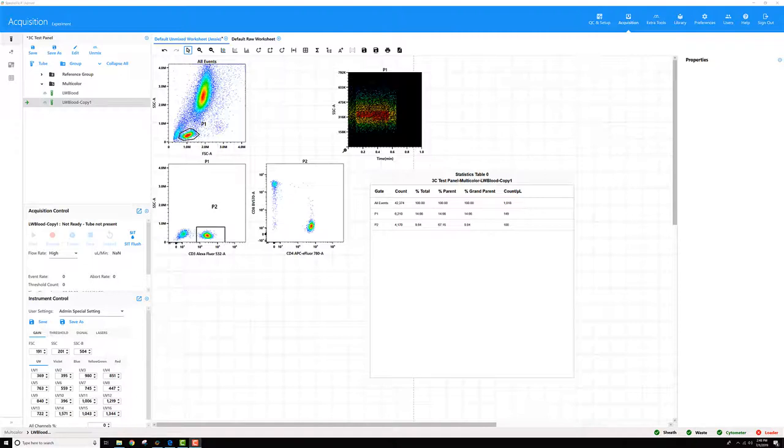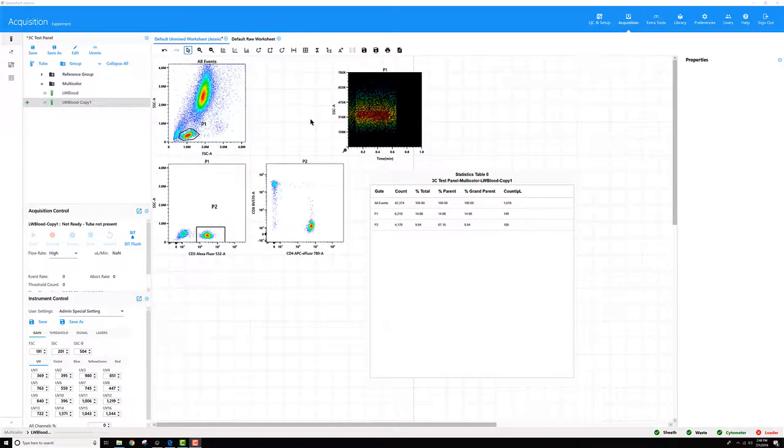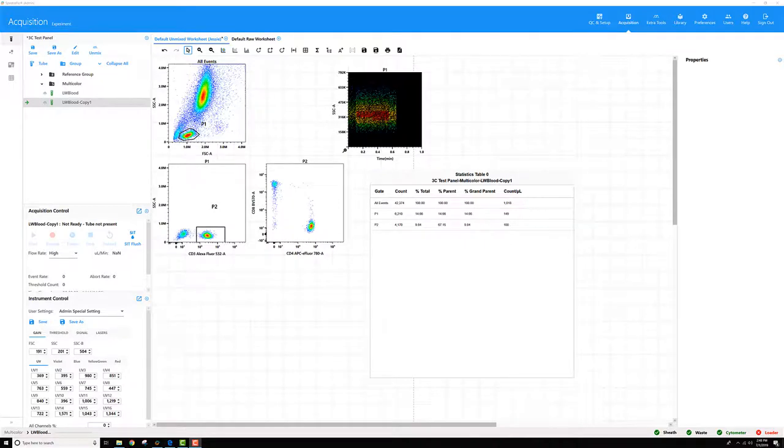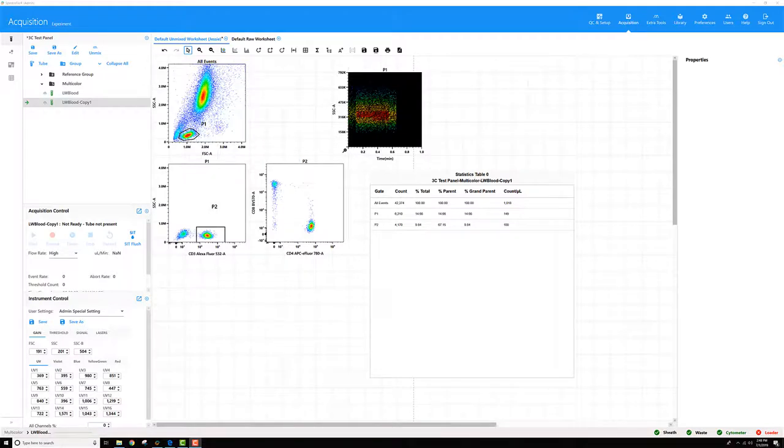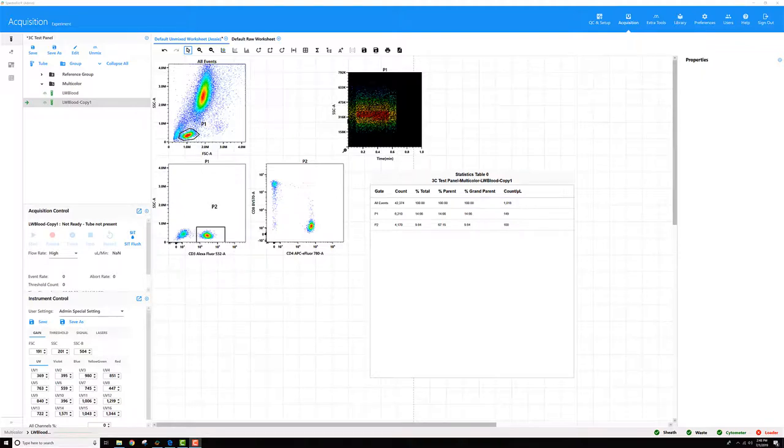A couple other things to watch out for. Sometimes when you're recording a tube, it takes a few seconds for the fluid stream to stabilize and the number of events per second to stabilize as it's passing through the flow cell. You can see this a little bit here. For this particular tube, I probably should have previewed a few more seconds to let things stabilize before pressing record. This will help improve the consistency of your counts as well.